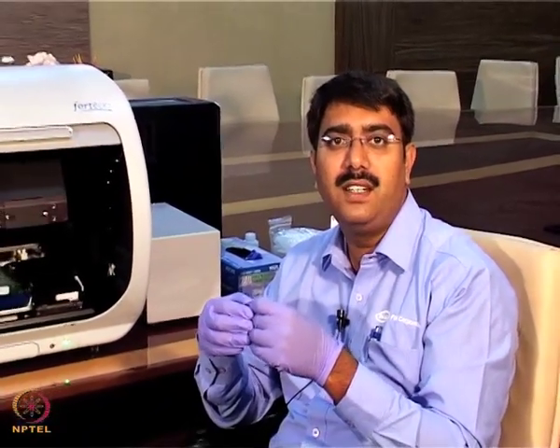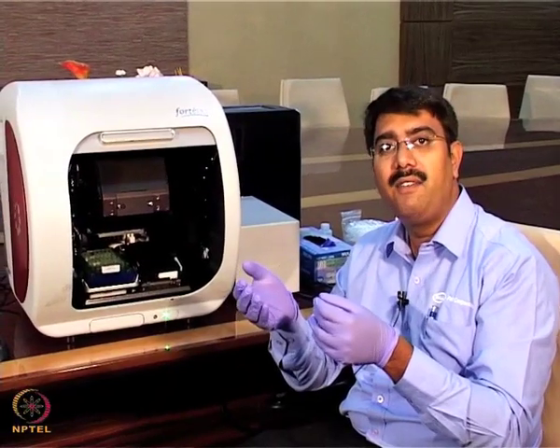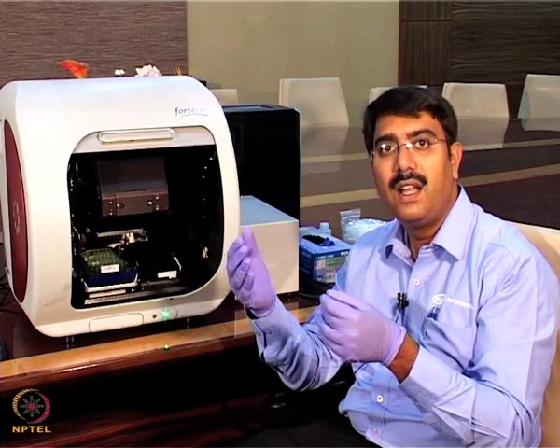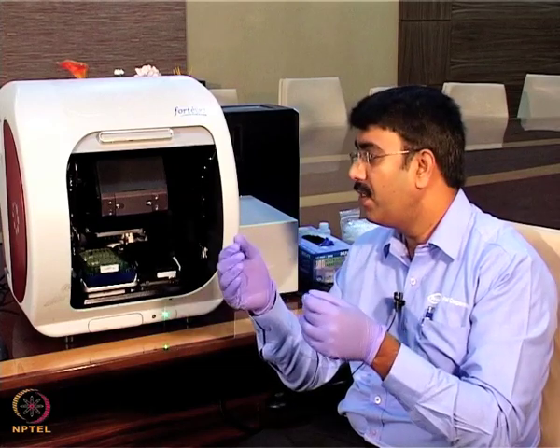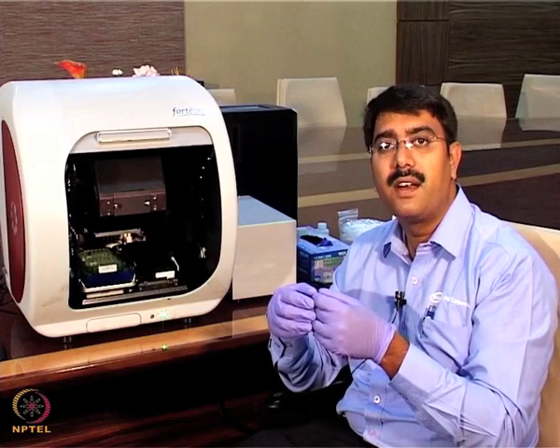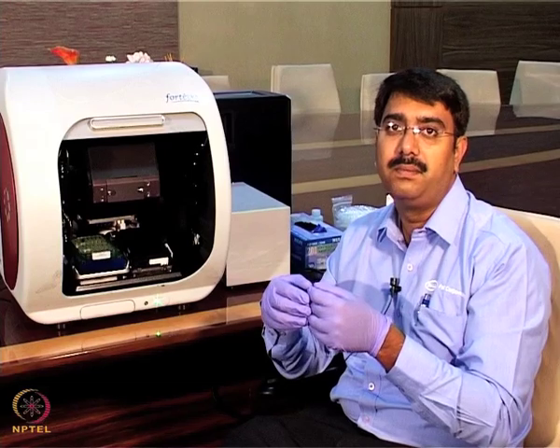Say suppose in the case of industry or any protein, if you want to do a quantification, directly we can take known concentrations of the standards, generate a standard curve, and from that determine the unknown concentrations. Apart from that, the major use of this instrument is to study binding kinetics, where we will determine the rate constants like on rate, off rate, as well as the affinity constants.